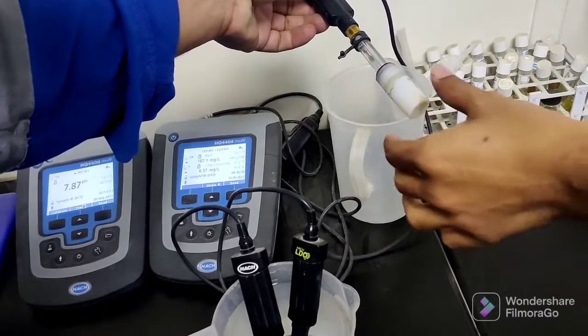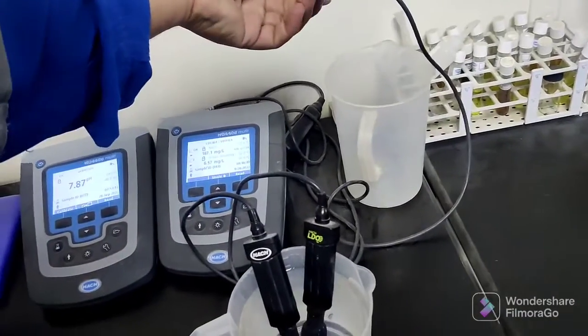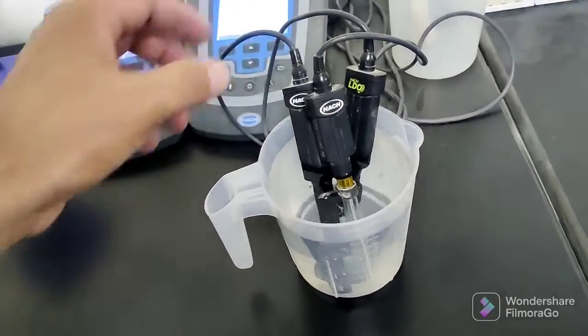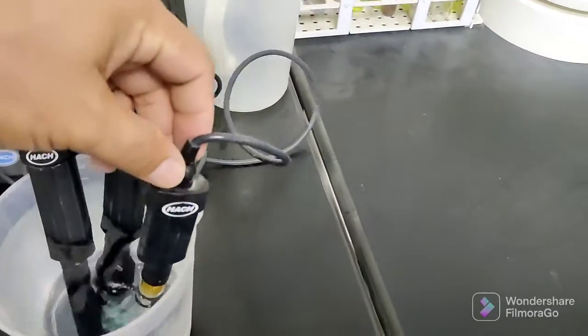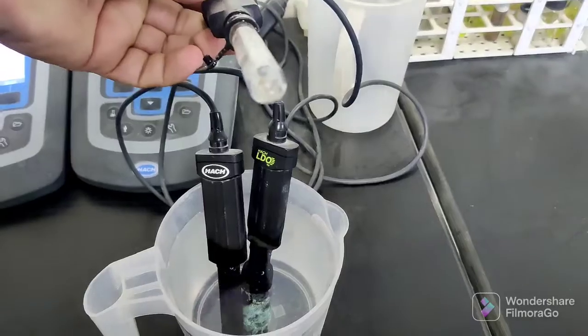First of all you need to remove the top cover cap, and then we will insert it in the water. This is a pH meter. You need to check the water — the pH, potential of hydrogen — and also dissolved oxygen and conductivity of the water.